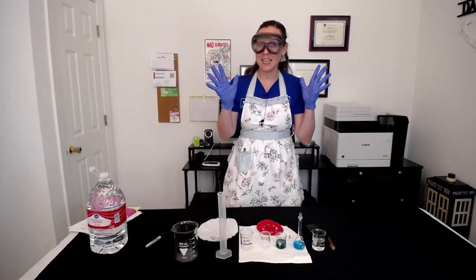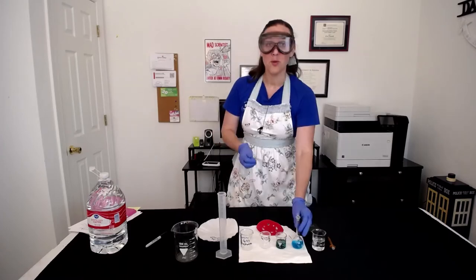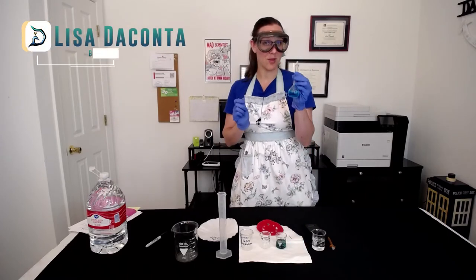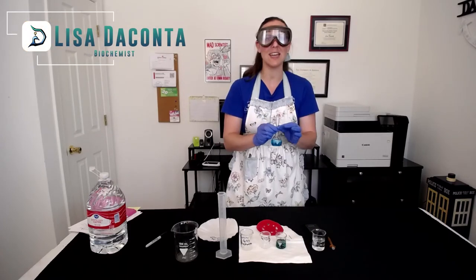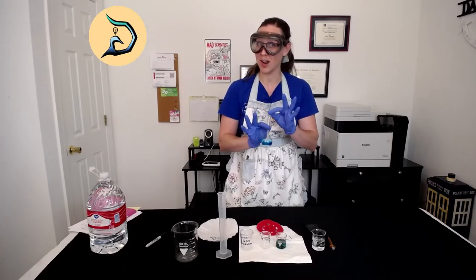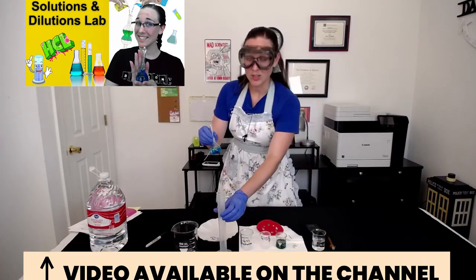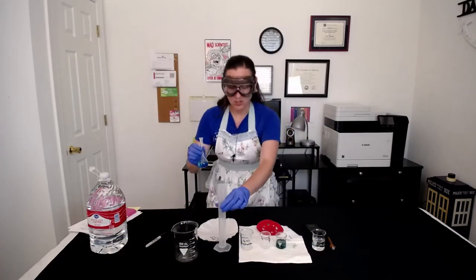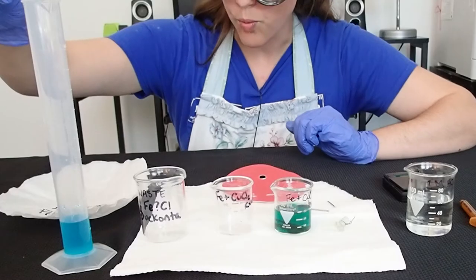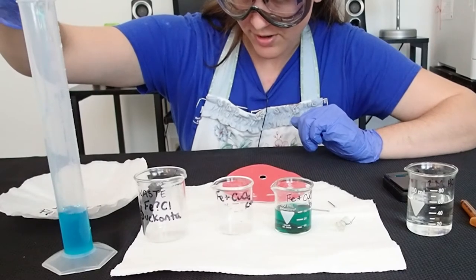In order to see if we form iron 2 chloride or iron 3 chloride when an iron nail is reacted with copper chloride solution, we're going to need to measure out 25 milliliters of this one molar copper chloride solution that we made in the previous video of Solutions and Dilutions Lab. Using a graduated cylinder, make sure you get down at eye level so that you can measure from the meniscus the 25 milliliters you need for this experiment.